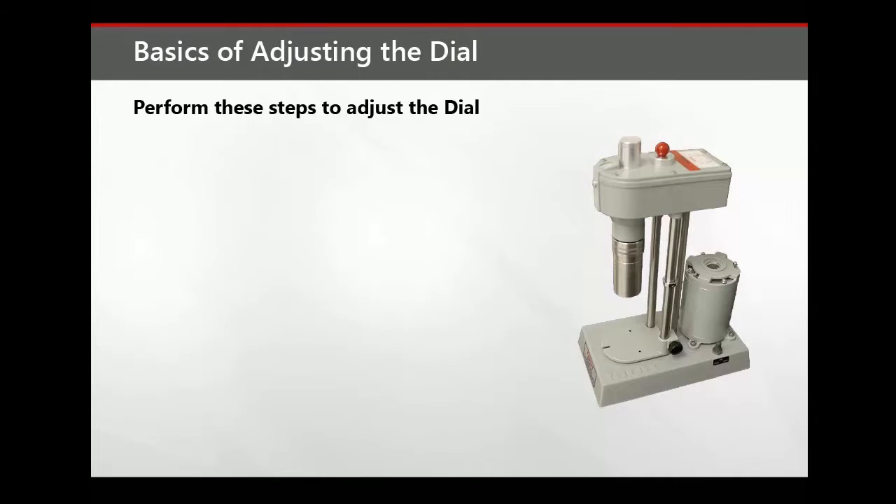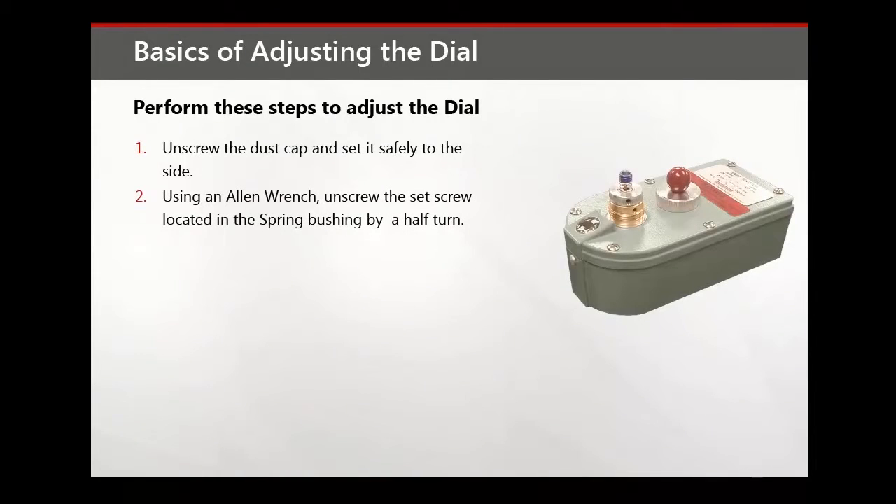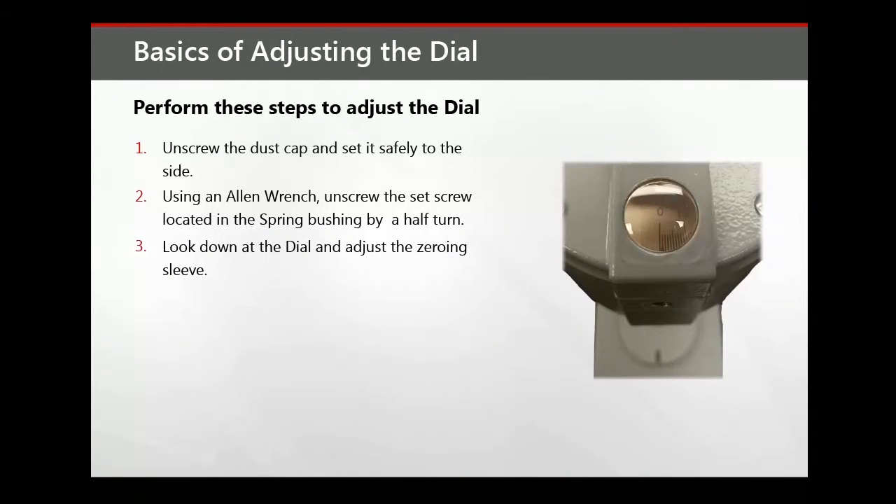Perform these steps to adjust the dial. Unscrew the dust cap and set it safely to the side. Using an Allen wrench, unscrew the set screw spring bushing by a half turn. Then look down at the dial and adjust the zeroing sleeve as necessary.